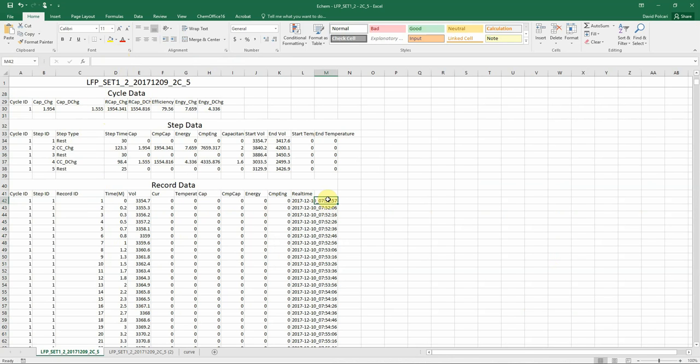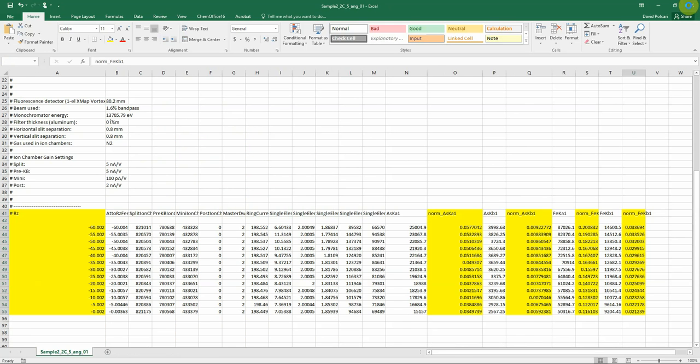Now, as a quick note, the computer that we used when we went to Saskatoon was not properly set. So although it showed 7:51 here, it was actually 6:51 because there's an hour delay, a time zone change. So I'm going to have to use a time of 6:51 when I run this function.